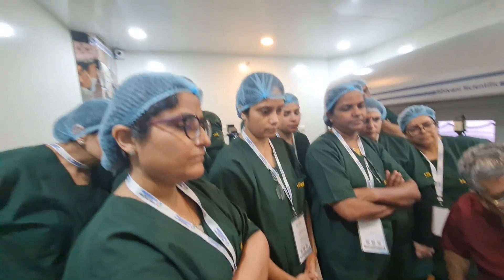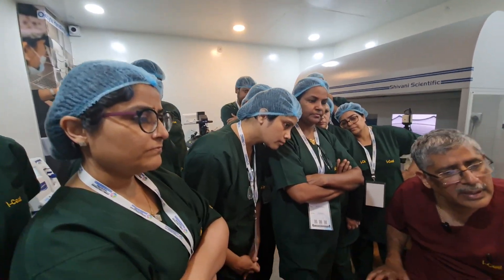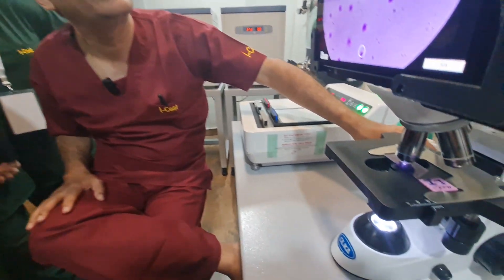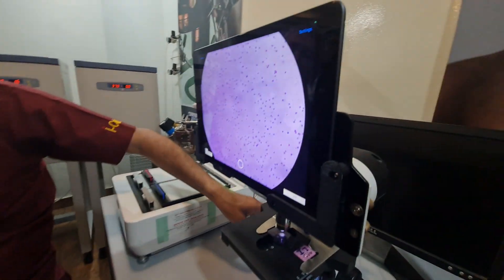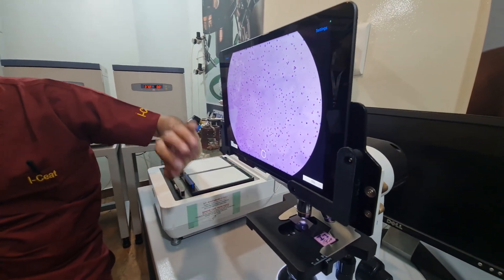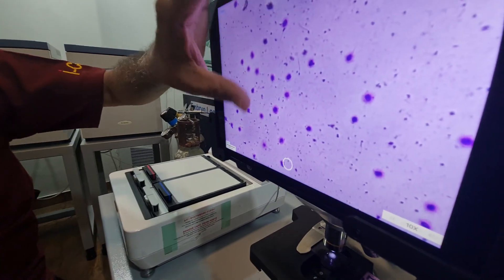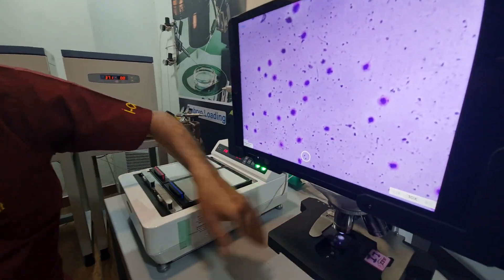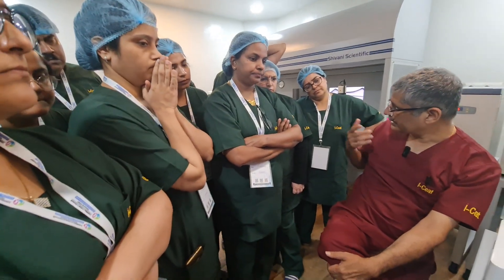Just telling you that this is the way we focus our microscopes. Now if I go back to 40 — not seen here because I was at 100 — and once I go to 10, what happens? I go back and make it more clear; you can also magnify it like this. This is the beauty of having these high-end microscopes — they can record your images like a laptop.